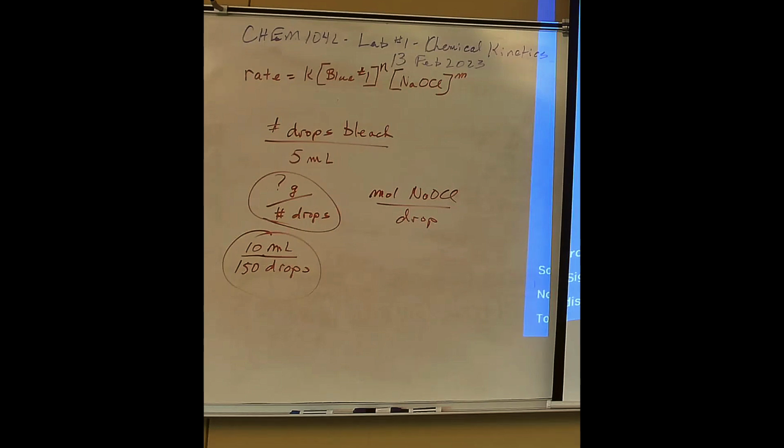And then that was just. Oh, I put that here. And then the absorbance value every 10 seconds. I think that's something. I see. So yeah, that's just that. First, the number of drops to get around 3 minutes or less. No, put that there. We're only using the board. As long as you put it in data with the formula for it. And I don't know this, just to get a run.